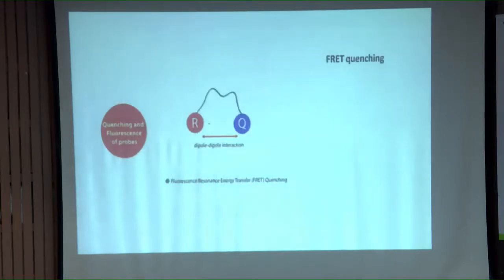What happens is energy passing upon light hitting on the fluorescence, dipole to dipole interactions. Please read during the course of this training here. Let us interact on this again. And this is one form of quenching the activity of fluorescence, right? This is happening after light passing through the fluorescence, right?